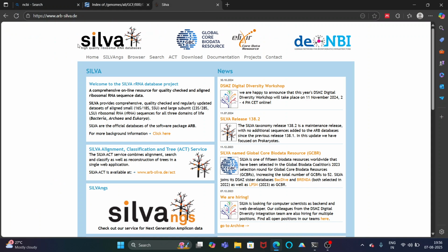This is the Silva database. It is a database that consists of ribosomal RNA that is found in all organisms. So we can download the FASTA files of ribosomal RNA found within all organisms. What I will do is go to this option, download, and I will click on RK.